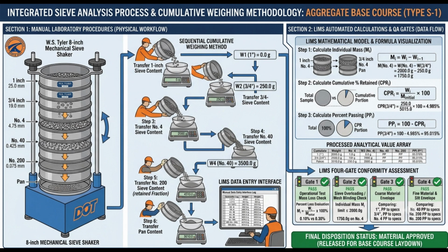Then, after fraction separation by vibration, the remaining material on each screen is added on a scale cumulatively, and after each addition, the measurement is recorded.